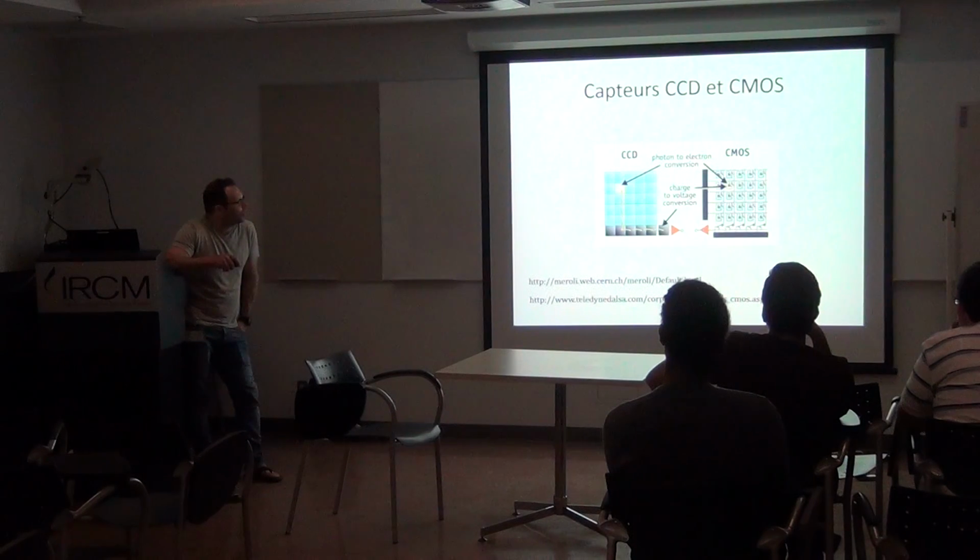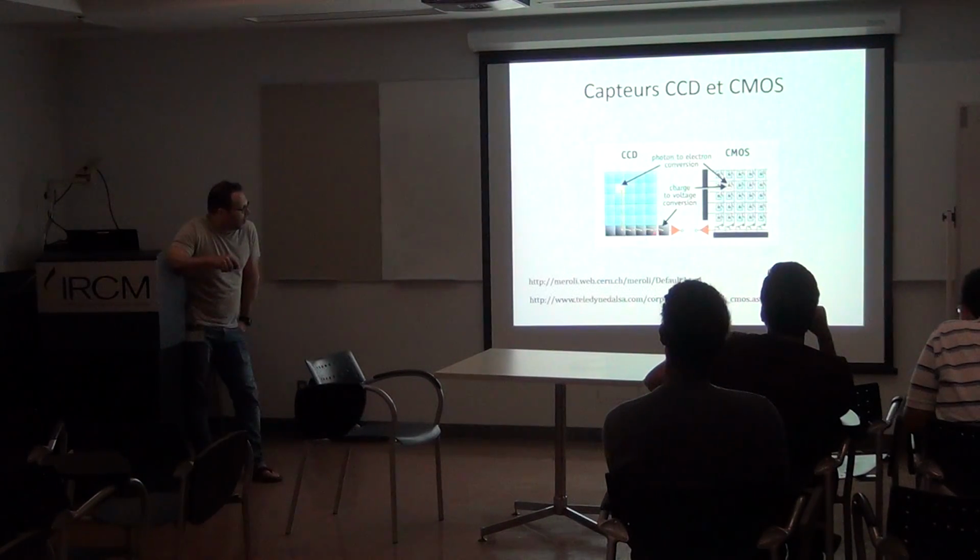So while the pixel gets the data, it transfers right away the data to the device or the computer. Okay, while when you use a CCD, let's say this pixel captures a certain number of photons, it will transmit this data to the other one, and then the other one, and then the other one.